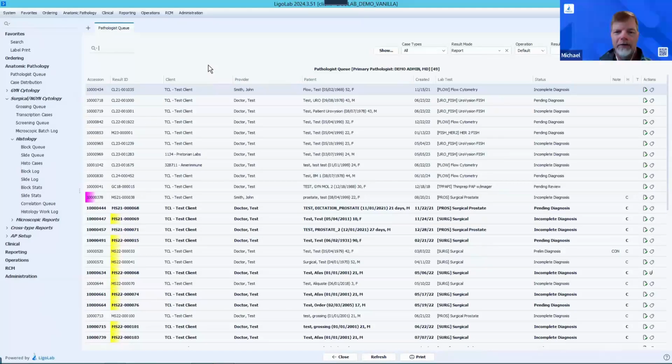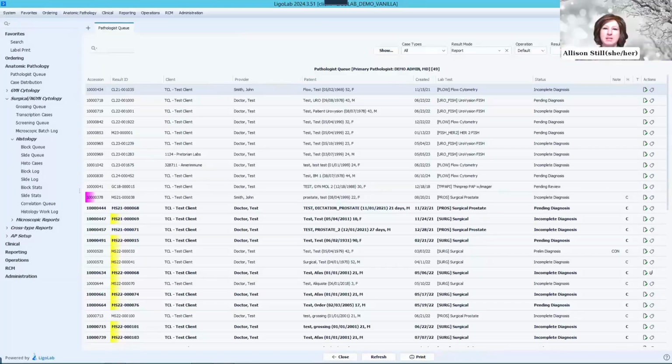Another good question, really good, considering what we just saw from you, Allison: how long does it take for someone to be proficient in the system and all the functions and features available? Partly it'll depend on how many workflows the laboratory has, right? For the smaller clients, like a small derm path, you only have one workflow. I would say it's really quick, depending on how much time you have to devote to being proficient.